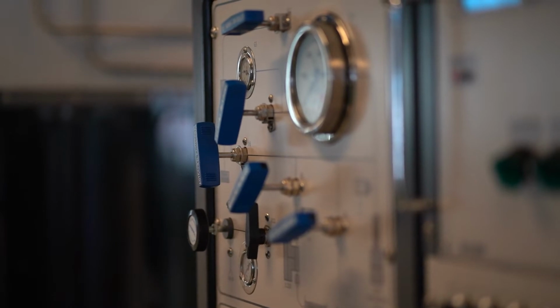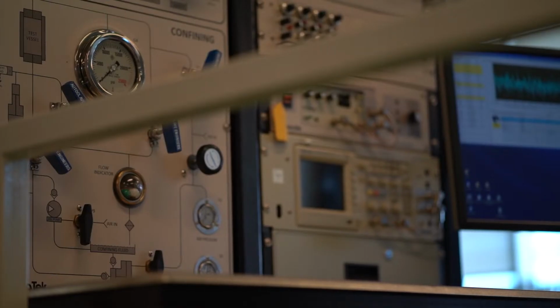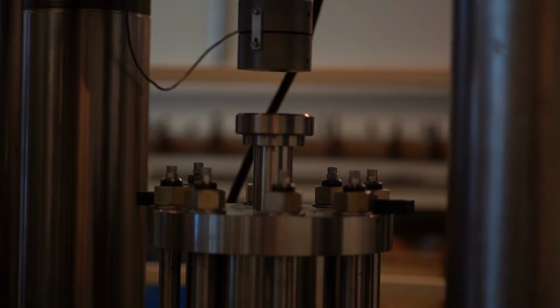Once we have selected the sample, we have taken it to the lab, and once we have trimmed it to our desired experiment, we want to make a description of the rock. For example, for a geomechanist or a geophysicist, it may be interesting to know what force you have to apply to break it. Okay, so the force applied is part of the mechanical description of the rock.